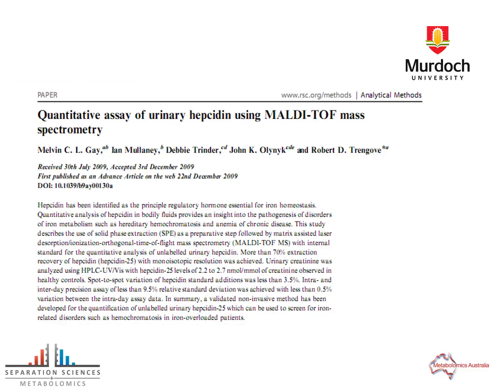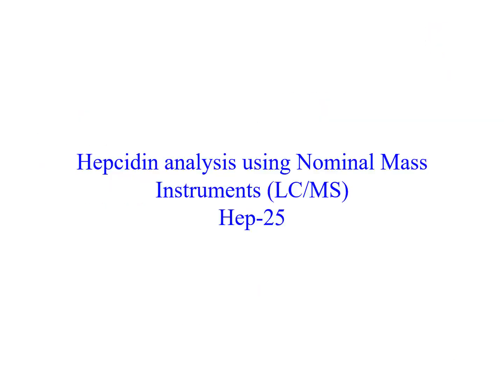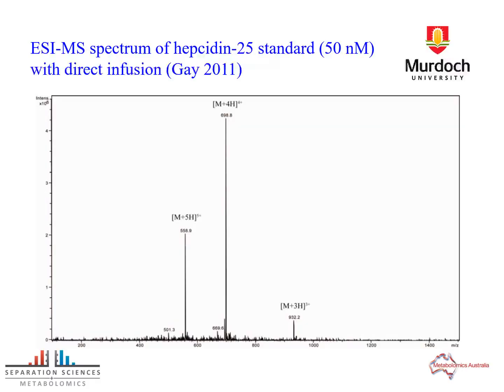And here's the paper which we published in Analytical Methods. Now, we then moved on from using a MALDI based assay because it was very time consuming, and we tried to develop a methodology using nominal mass instruments, and in particular LCMS.